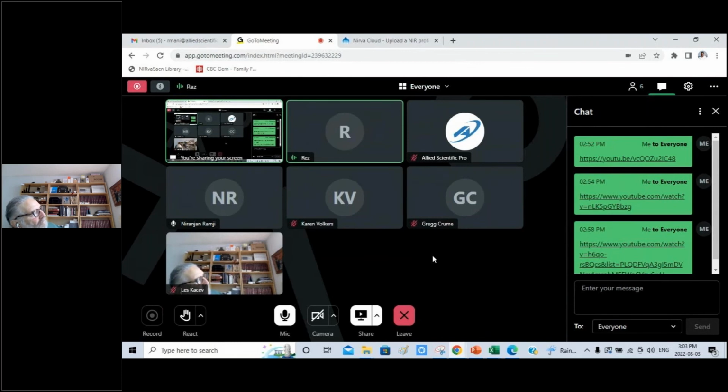We could provide you that app if you request it. If the customer who had the samples measured agrees to be open, then we can provide you that app, and then you could use that data as your calibration, and then make measurements, make predictions.